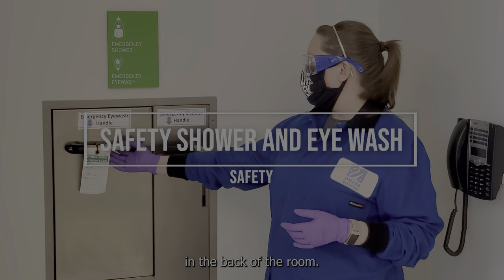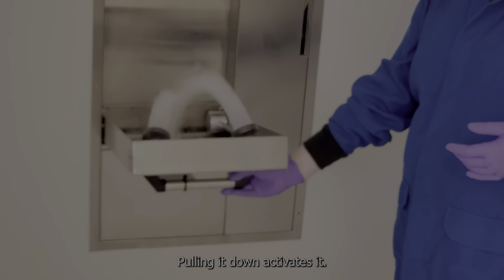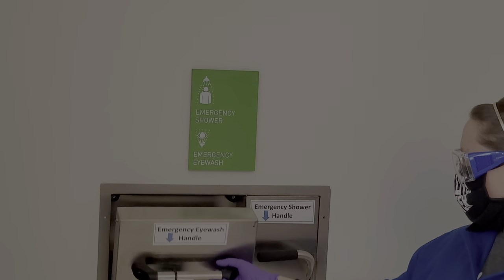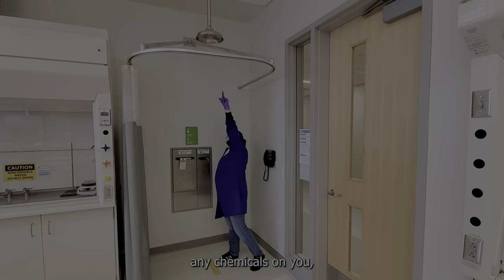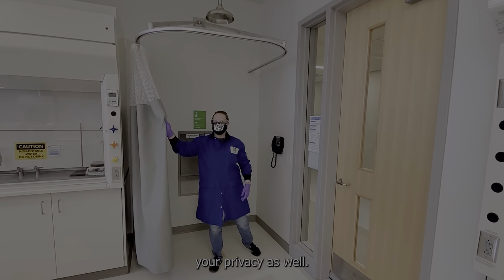A quick refresher on the safety shower and eye wash. In the back of the room, there's an eye wash that's readily accessible. Pulling it down activates it. And if you have spilled any chemicals on you, there is a safety shower. There is a curtain for your privacy as well.